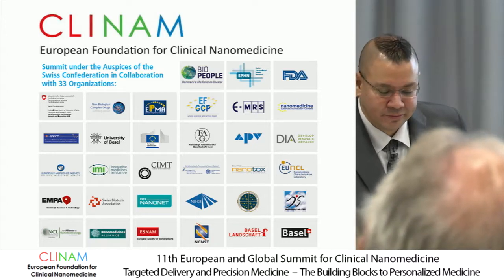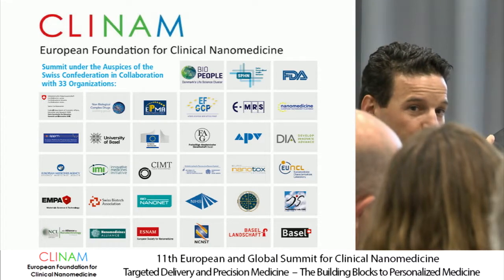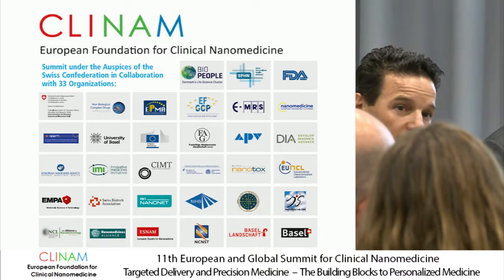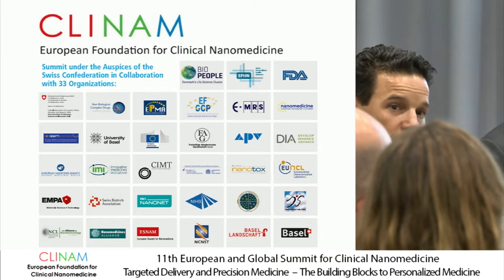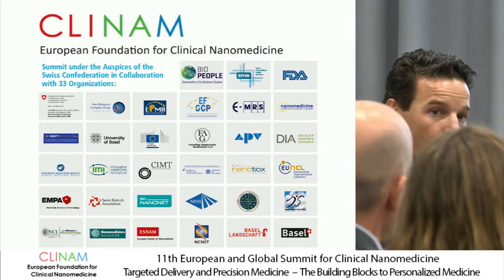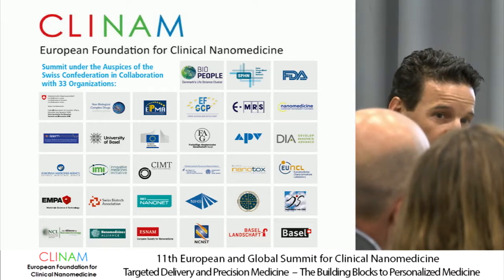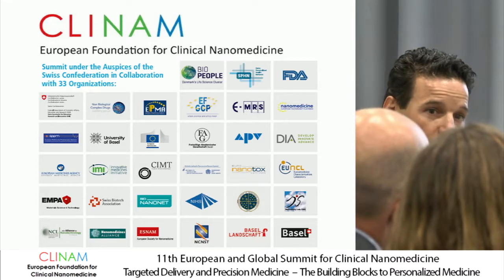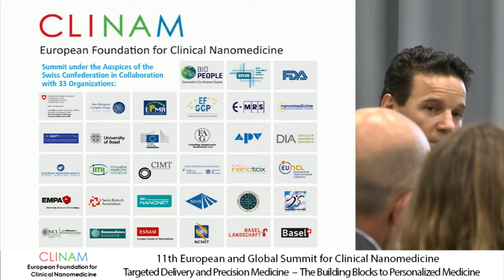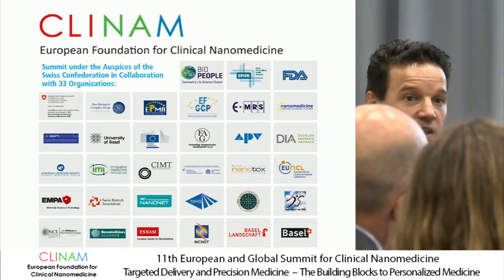I want also to add into what Jeff has said and reiterate what also he had inputted into his slide. The use of reference material at every stage on the cascade is also critical to determine, and the comparison with equivalent molecules that can actually fit the purpose for the specific measurement also enables us to go towards the biological application. And that is an aspect that also FDA has addressed, as the European Medicines Agency has, in the way that when you develop nanomedicine, you need to prove to have efficacy.